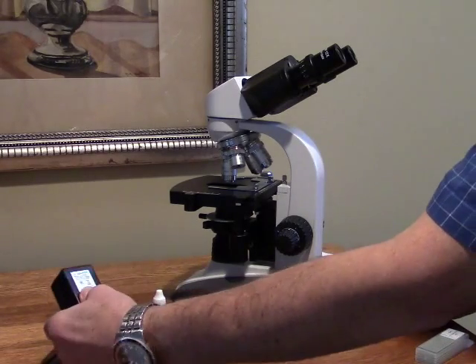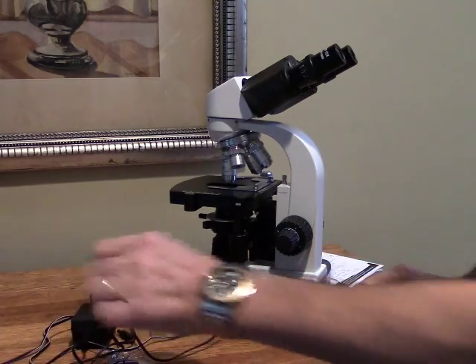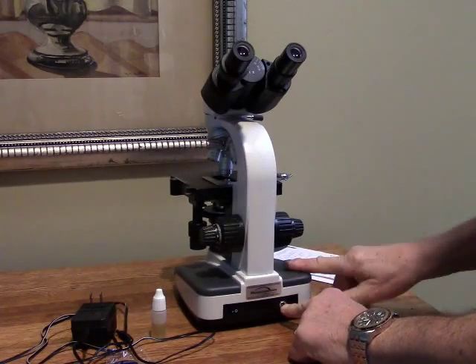You also get a few other things. This is an AC adapter, which is 120 to 240 volts, 50 or 60 hertz, so that can be used internationally, and you're going to use that adapter to plug into the back of the microscope here to charge the battery.